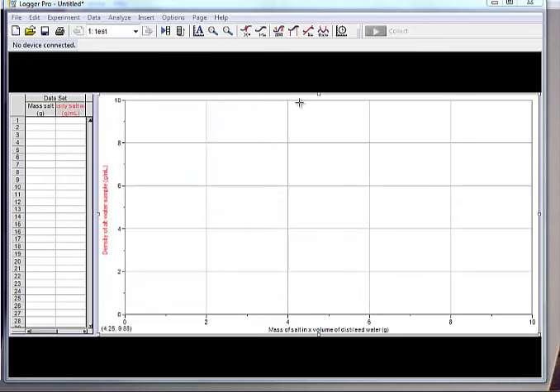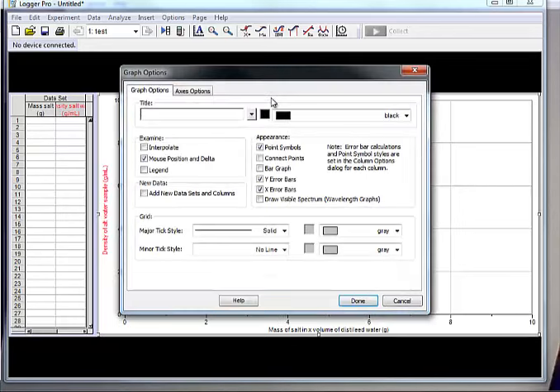All right, so we're going to click right here at the very top. We've got our column labels on the graph set up. We've got our axes labels set up here. Now we're going to put in a title, and we're going to click right here. Okay? Now, I'm going to let you and your group figure out your own title.